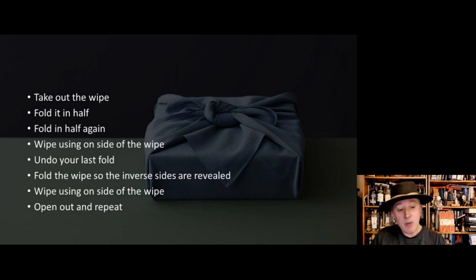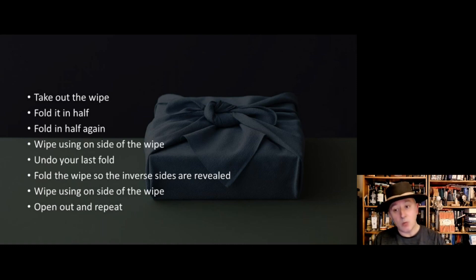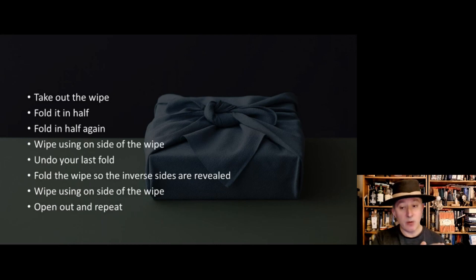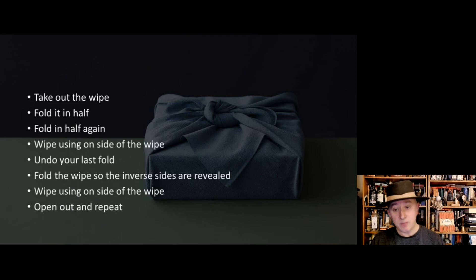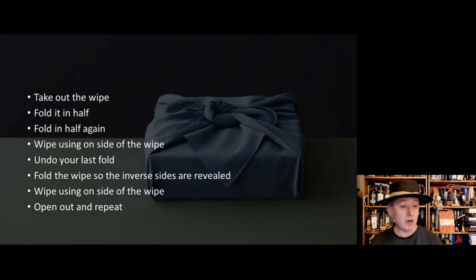To summarize the folding technique before watching the video: take out a wipe, fold in half, fold in half again. Wipe using one side, undo the last fold, then fold so that the inverse side is revealed and wipe again on that surface. Open and repeat — giving four usable surfaces per wipe.